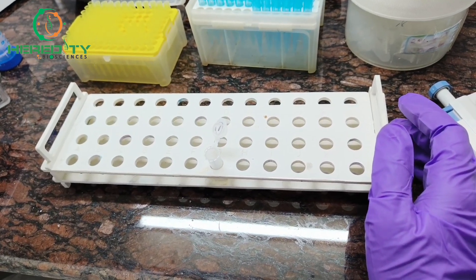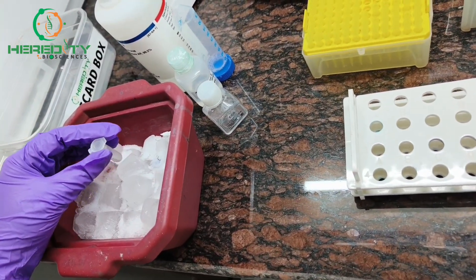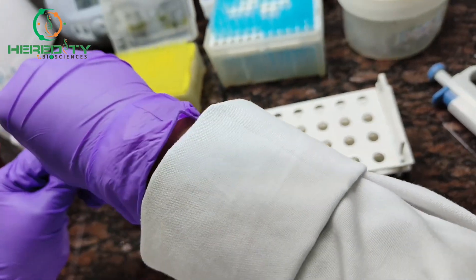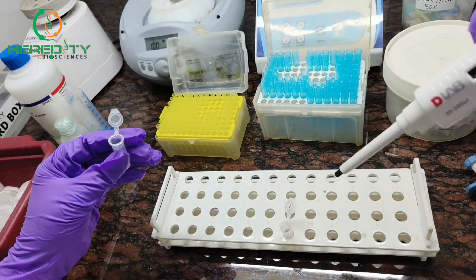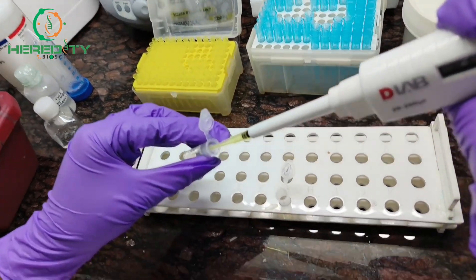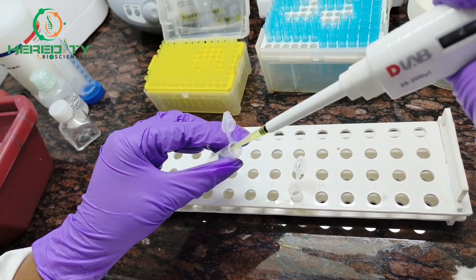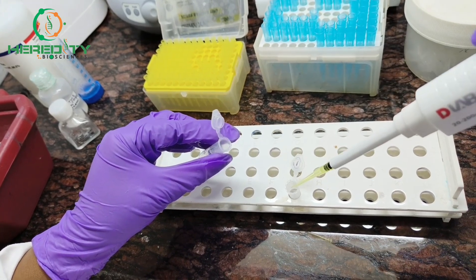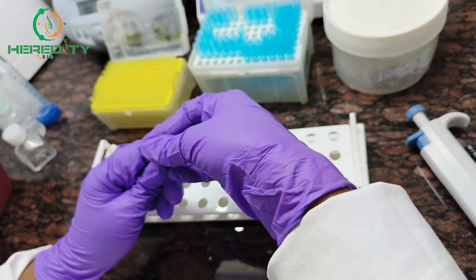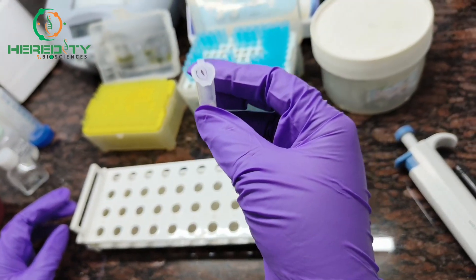Now we will add chilled isopropanol — equal volume of chilled isopropanol — to the collected supernatant. I have put the isopropanol on ice. Equal volume of chilled isopropanol will be added. Incubate it at room temperature for 5 minutes.